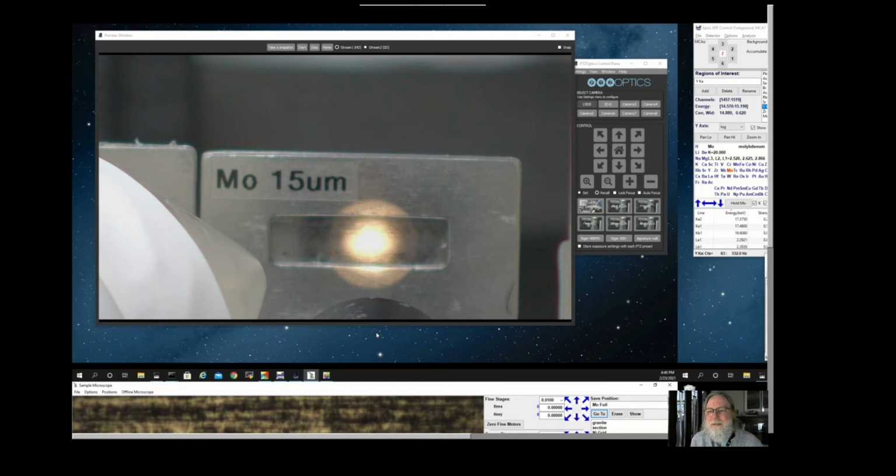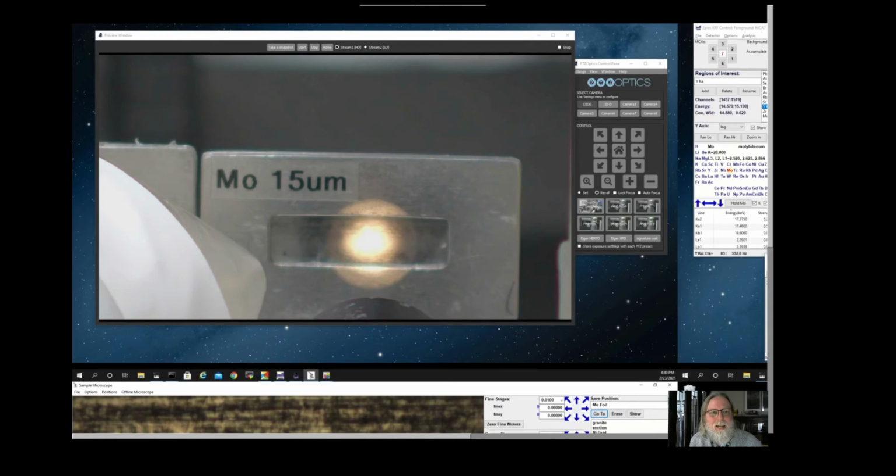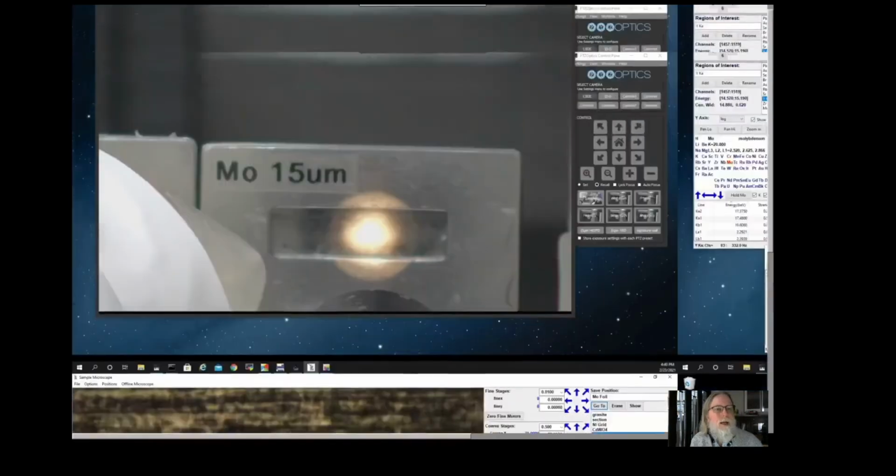Hi, I'm Matt Newville, one of the beamline scientists for the X-ray Microprobe station at GSE Cars. In this video, we'll assume that you have already connected to Ferrari, the control computer, and know how to move the screens around and see the various control applications.